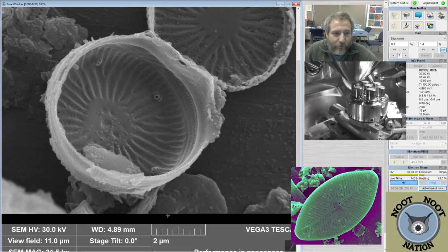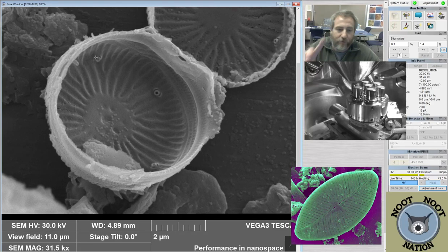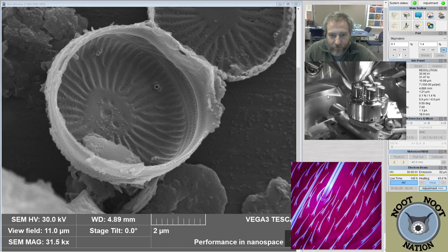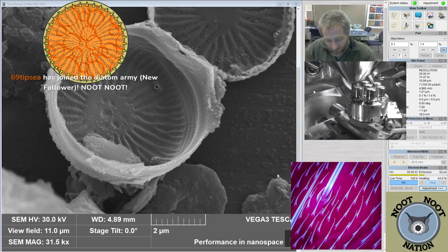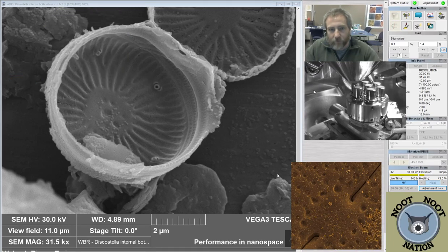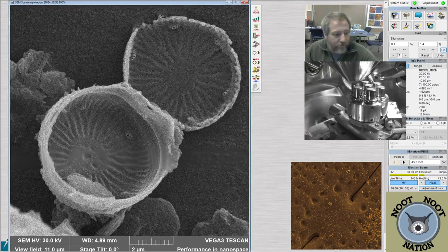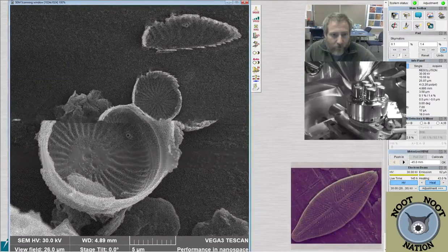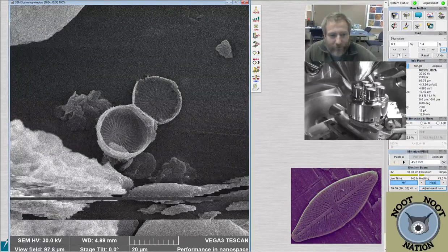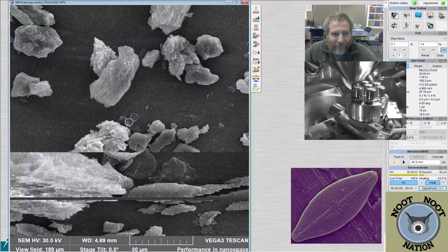This is a nice view of the inside of a Discostella, a little tiny Discostella. It's not Asterocostata, but it's cracked open in a really interesting way. So, Discostella, internal, both valves. Get a sense of what the inside of the diatom looks like, but we can't see the outside, right? So we have both internal views, no external view.